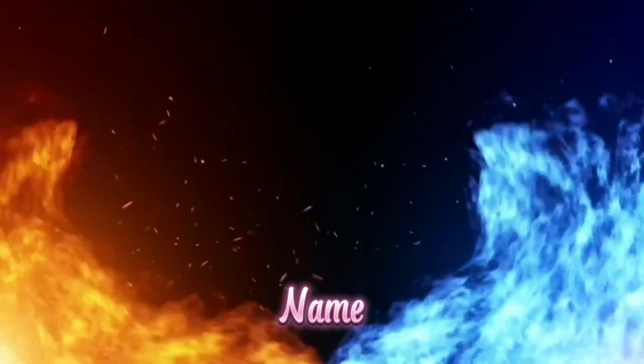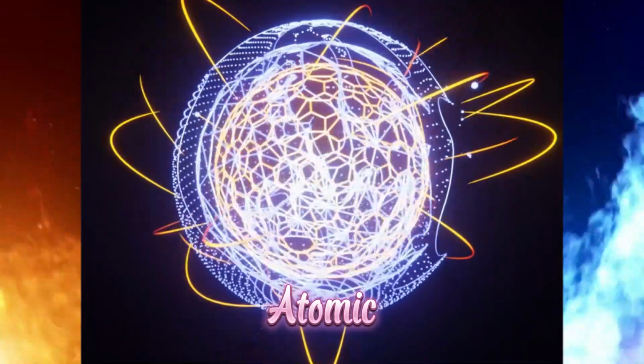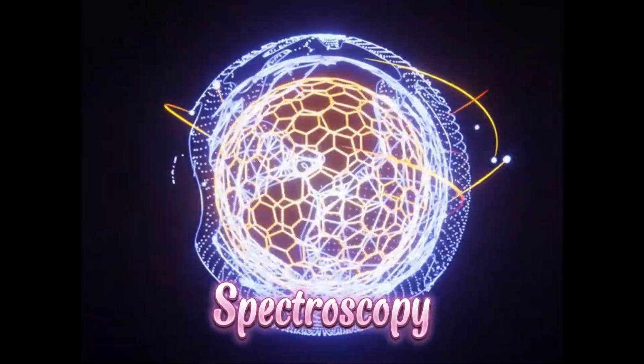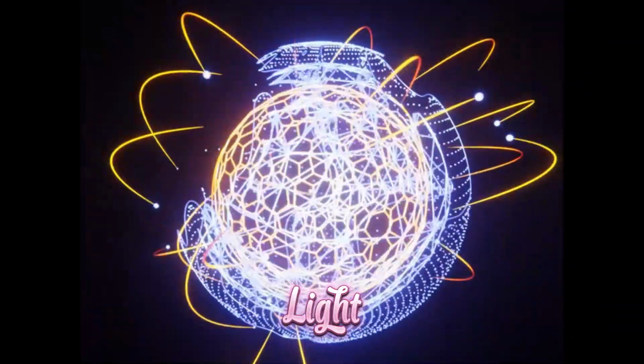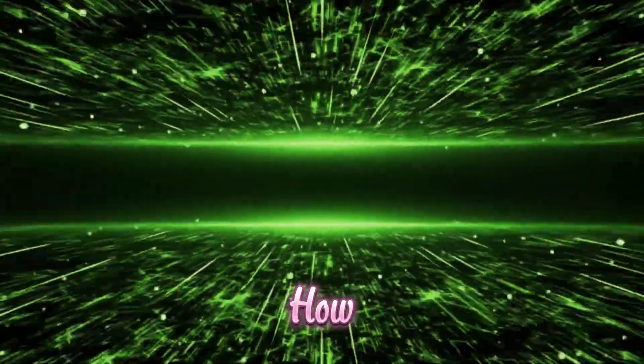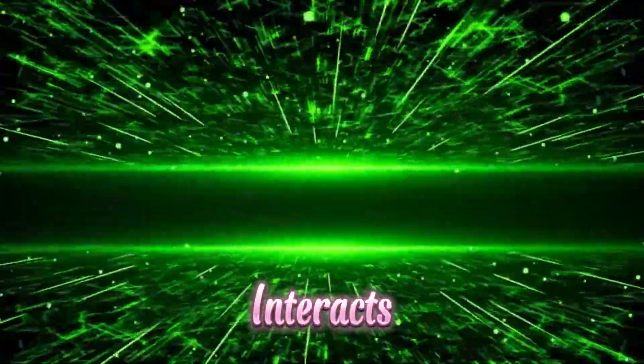Let's break down the name. Flame. Yep, we're literally using a flame. Atomic, because we're looking at individual atoms. And spectroscopy, which is just a fancy word for studying how light and matter interact. So, FAS is a method to figure out what elements are in a sample, and how much, by basically setting it on fire and looking at the light it interacts with.